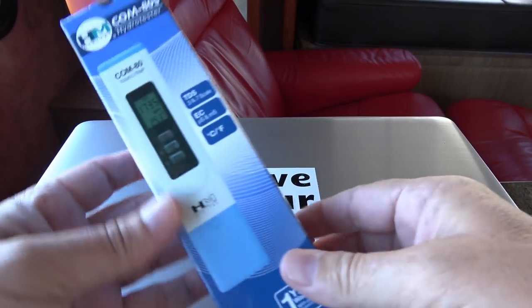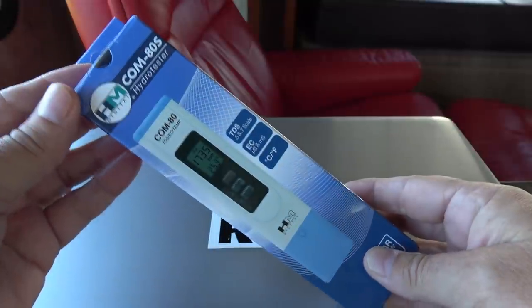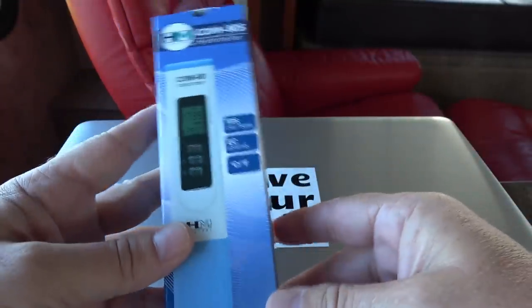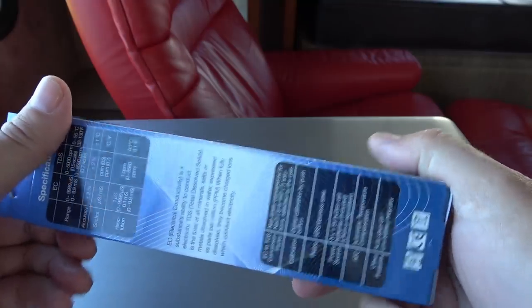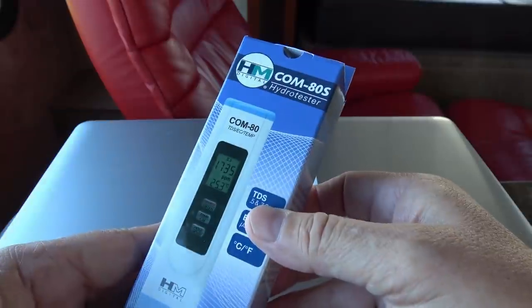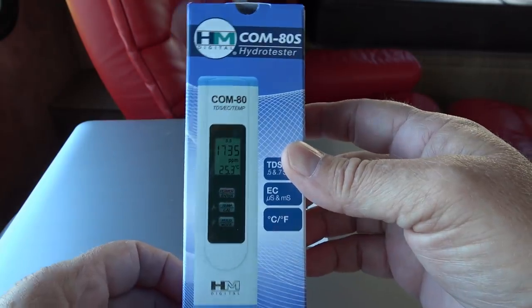Hey guys, Ray from Love U RV. Over the years I've tested several water filters for the RV, and every time in the comments section they always tell me about the device to measure total dissolved solids called a PPM meter — parts per million. Recently I was on Amazon buying some other stuff and came across one, so I decided to get myself one. It's kind of a nifty little gadget and we'll give it a test and see what it does.